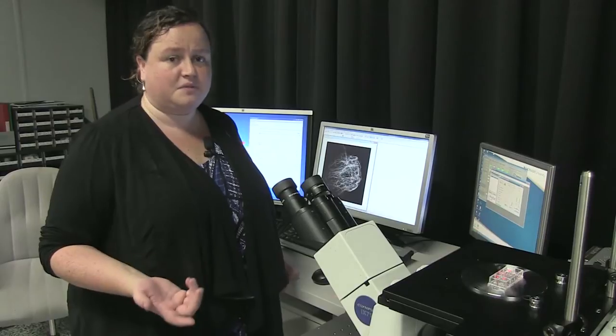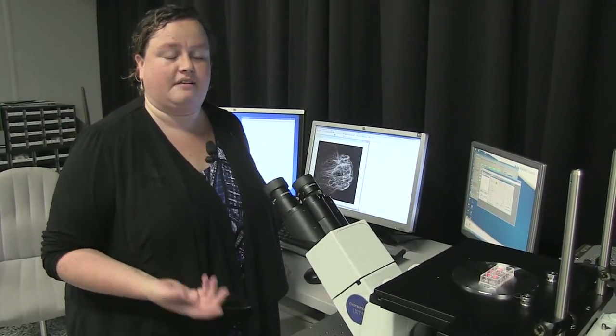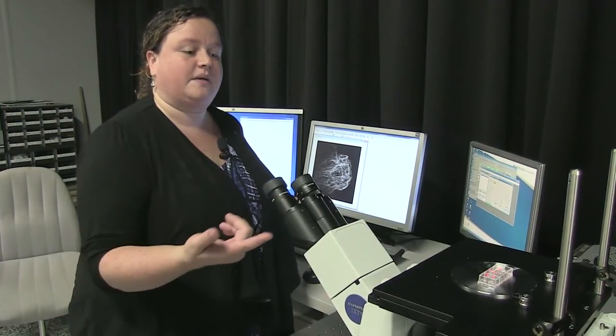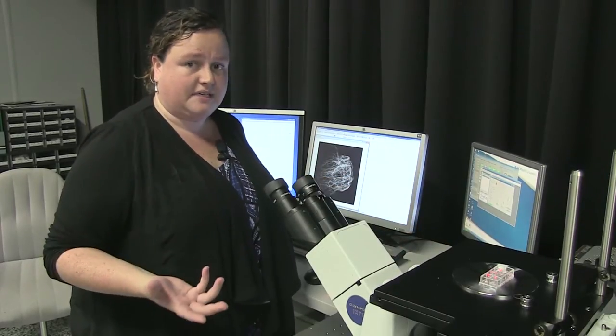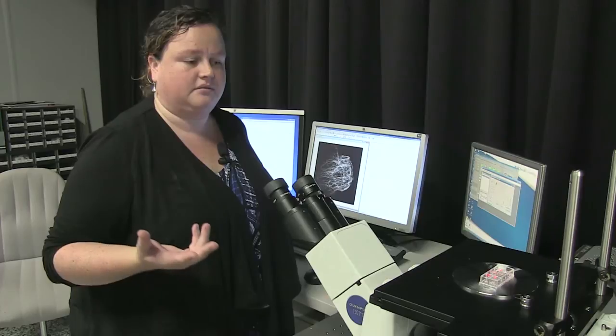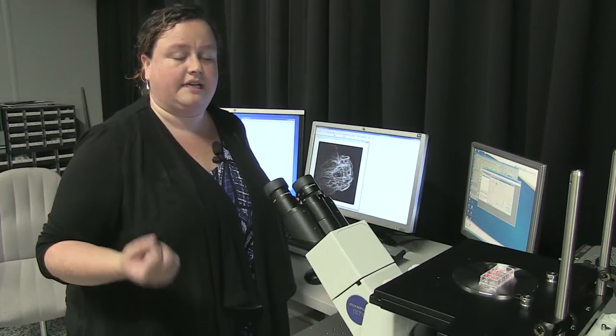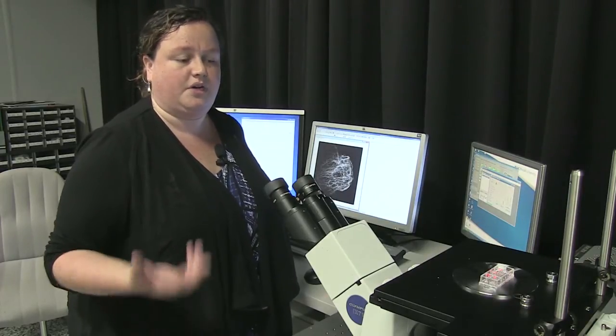Okay so in terms of actually taking a measurement assuming that you've got something that is well fixed and well stained, for example these multi-well chambers here are holding fixed COS7 cells that have been immunostained for microtubules and stained with Alexa 647 which we know blinks very well when you add a reductant.